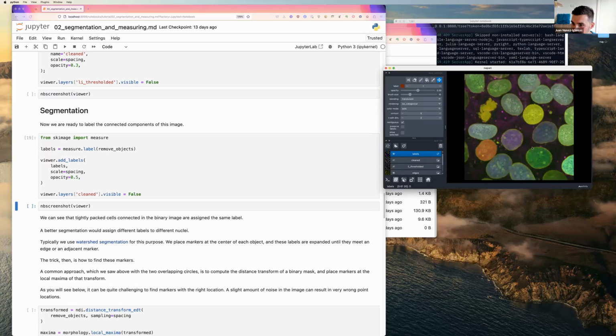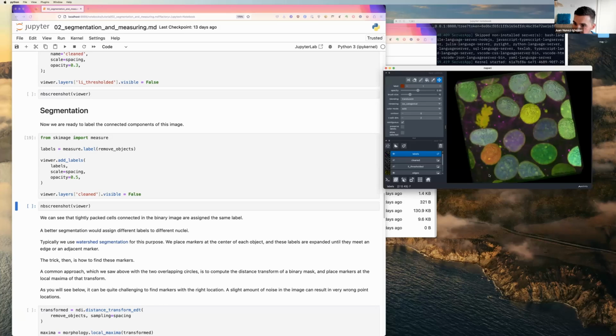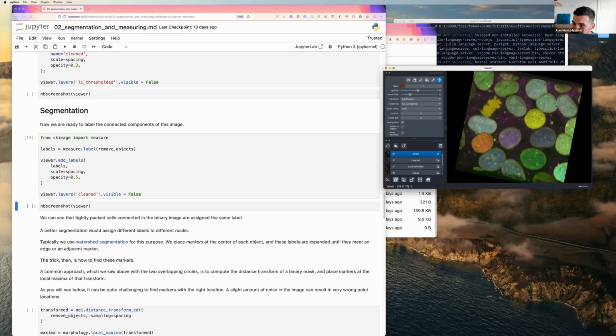So if I look at 3D, right, you can see each nuclei is labeled differently. There's only 2 things. This one's sort of still undergoing mitosis, so it's one object. And then all of the nuclei that are touching, because we don't have enough resolution, are merged together. So these 3 are merged together, these 2 are merged together, these 2 are merged together.